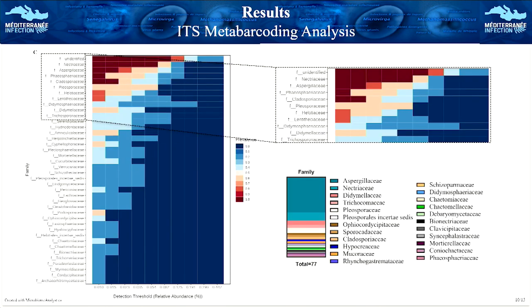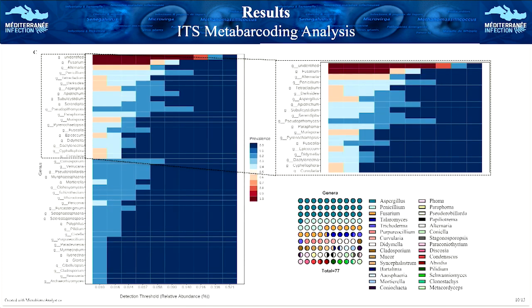Since metagenomics here relies on the number of reads, which means relative abundance, on the other hand, Culturomics relies on the observed species richness, which means the number of species per taxon or genus. So for example, for the Nectriaceae, which came first here, and then Aspergillaceae, inversely to what you observed here, it's linked to the fact that the number of species belonging to Aspergillaceae were more abundant in Culturomics. But using metagenomics, you can have one species belonging to the Nectriaceae which dominated the soils, and the number of reads results in these different profiles. So to compare them, we need to compare a top 10 or top 20 profile, like we did, and see if they were present.